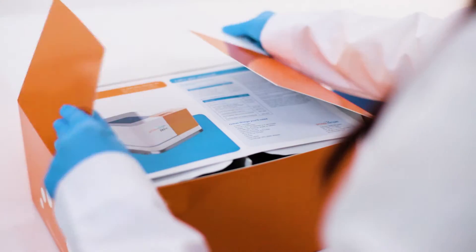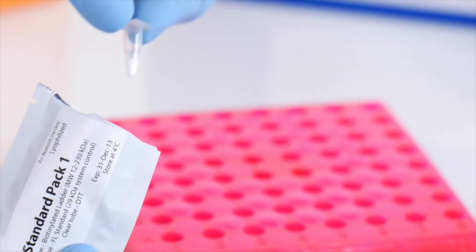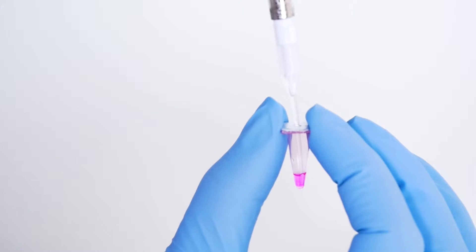Setting up an immunoassay on Wes is simple and you only need three microliters of sample. Just prepare the reagents and pipette them onto a plate. Load the capillary cartridge and place the plate on the plate holder.